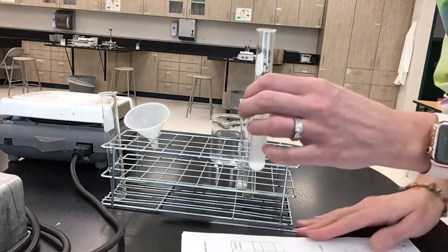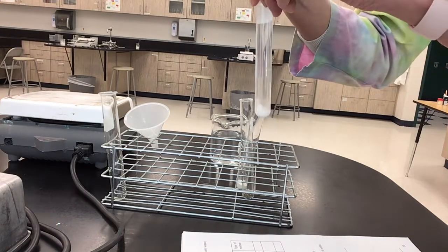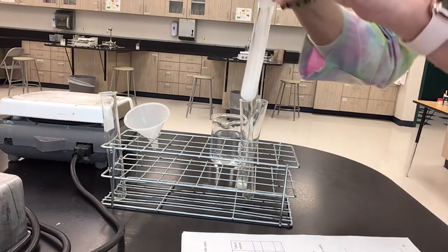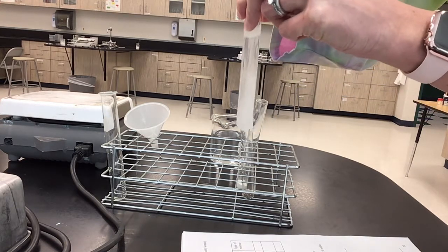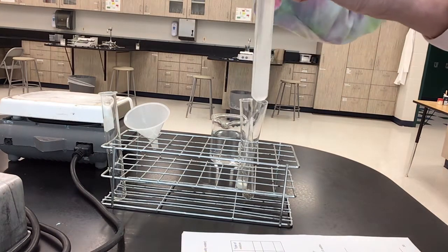And then we're gonna identify if it mixes up so that we can see, is it evenly or unevenly mixed? Give it just a second.